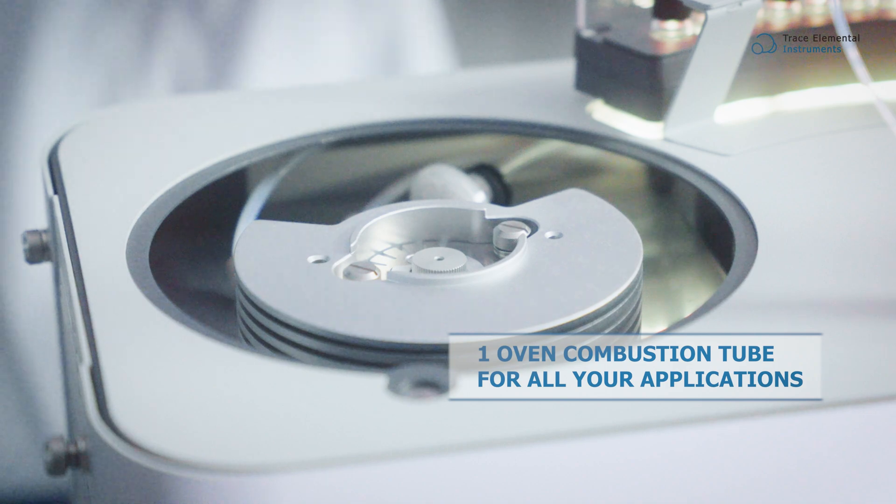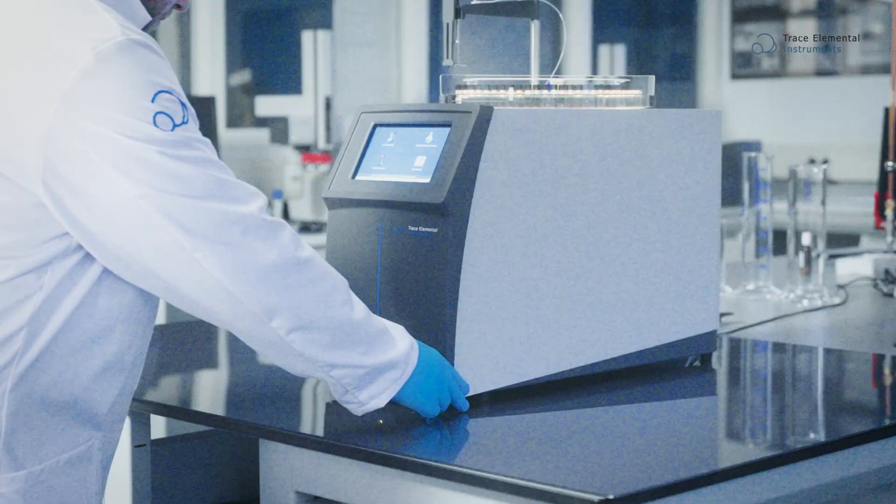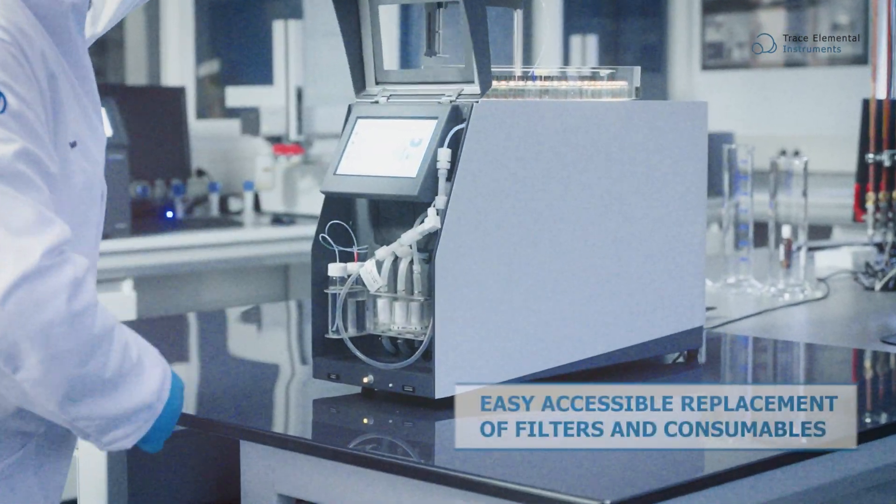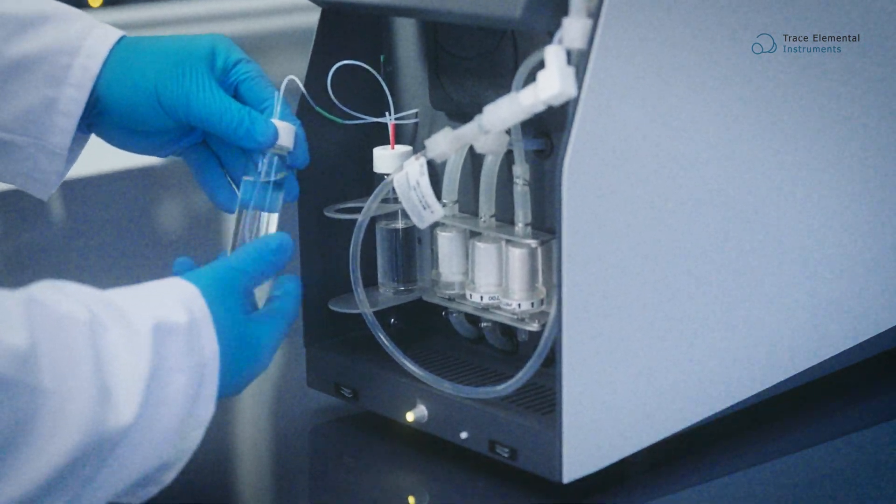The sample inlet system, including the combustion tube, is designed for easy access. Filters or other consumables last long, but when they need replacement, every part is easily accessible in the analyzer's conditioning section.